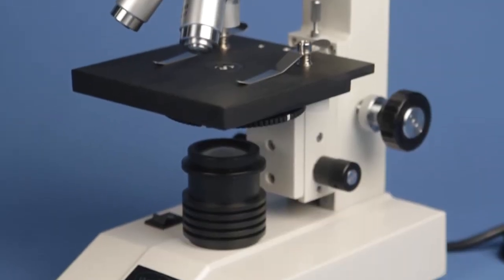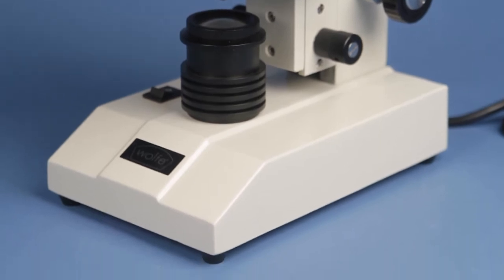The CFL microscope series is built for faster, more accurate focusing at high magnifications.